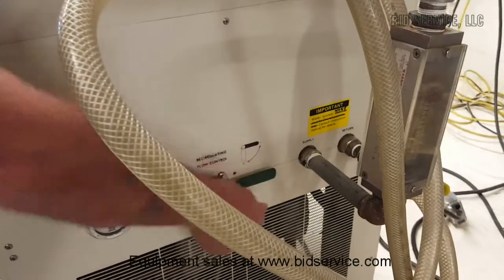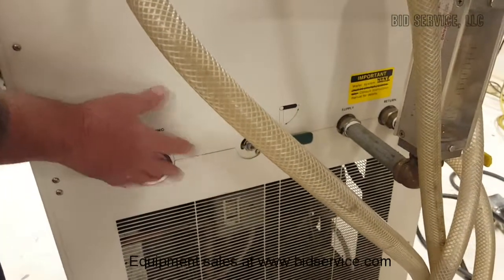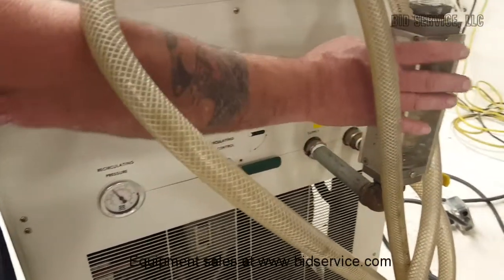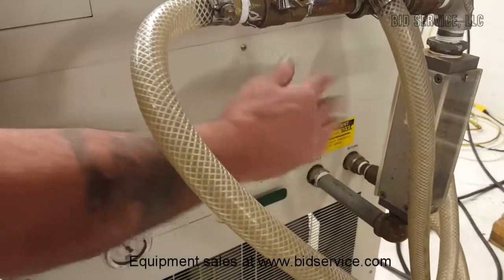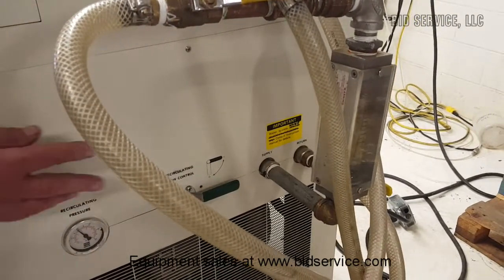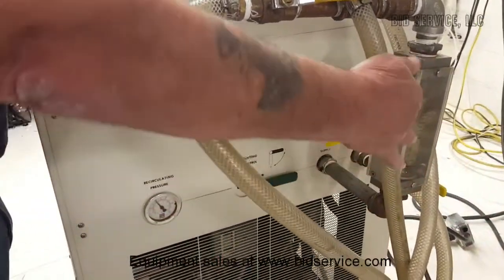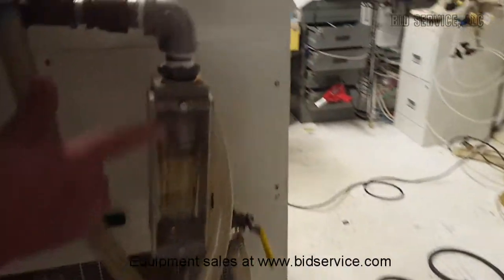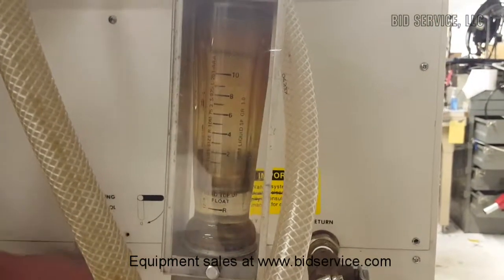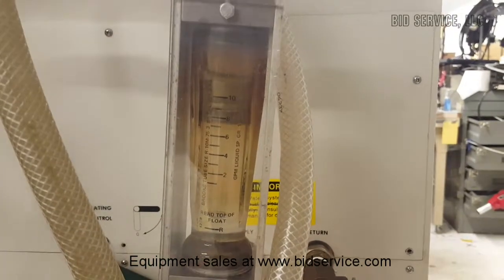Your pressure and restriction control is here and right here. This unit has a capability of 12 gallons per minute, it's really specced for 10 and it has no problem doing that. It has a CP55 centrifugal pump inside of it, and you can look at it here and see we are right at the top. I will turn it down so you can see it. We have no problem maintaining that flow rate.